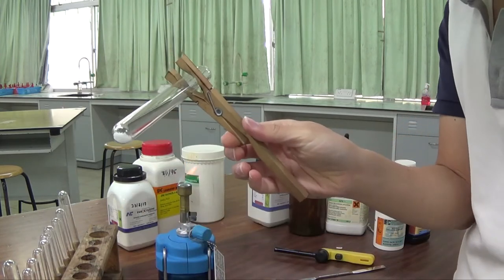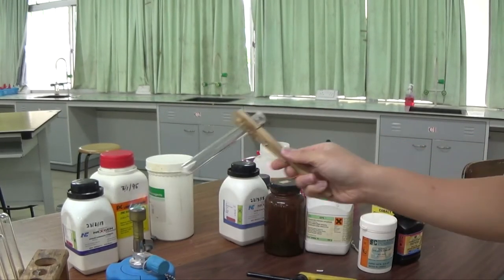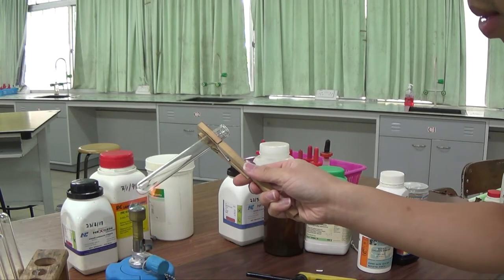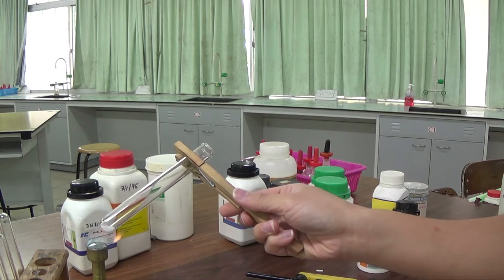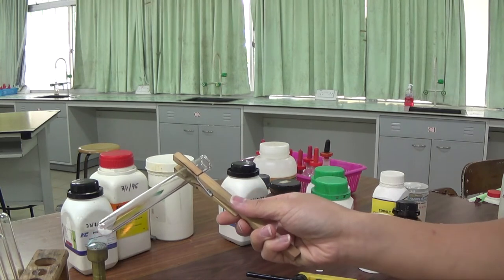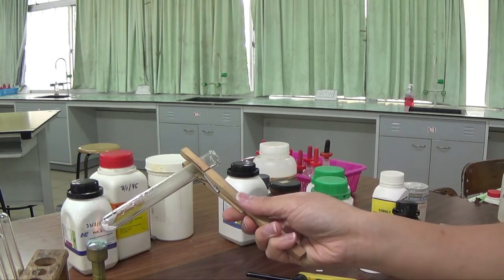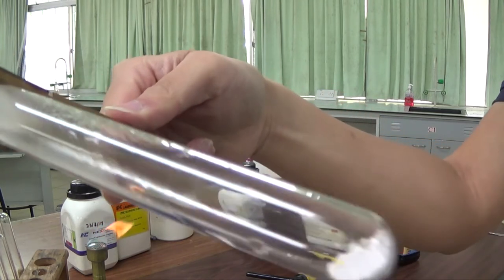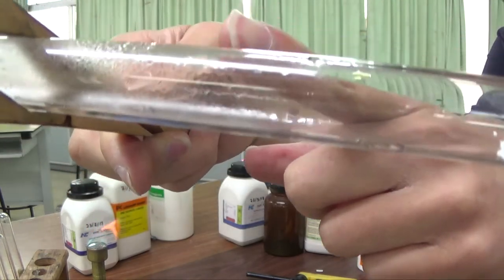So this is the white solid. You need to see exactly what happened when I heat it. Okay, so as I heat it, not too sure if you can see exactly what happens here. So I'll bring it close to the screen. You see the white solid there? You see some colorless liquid.